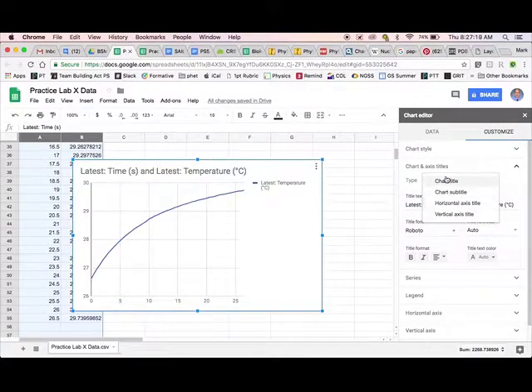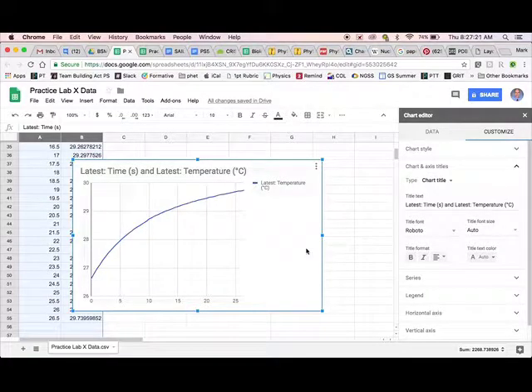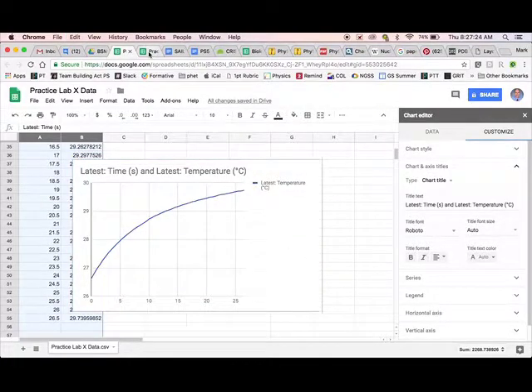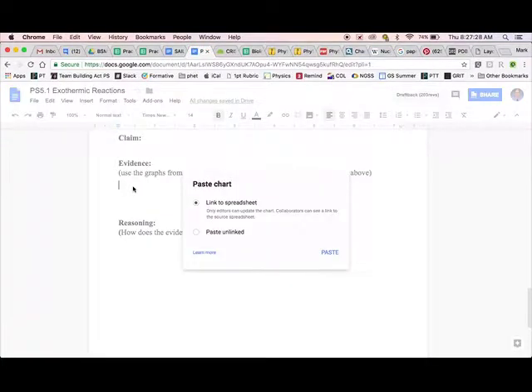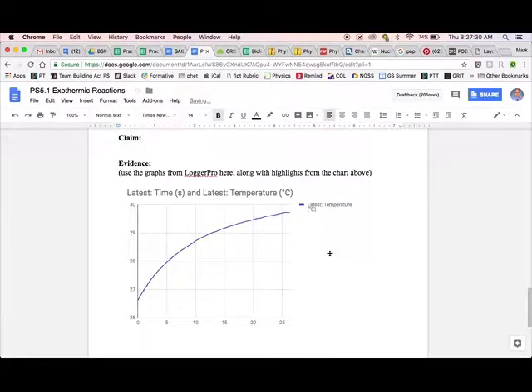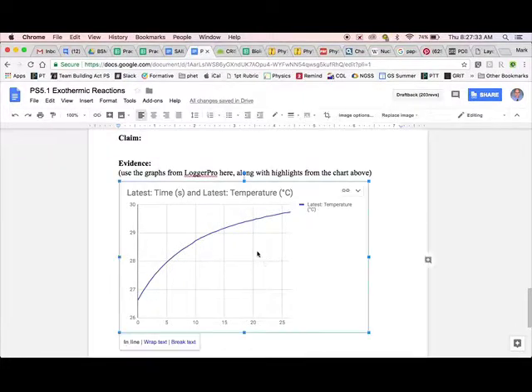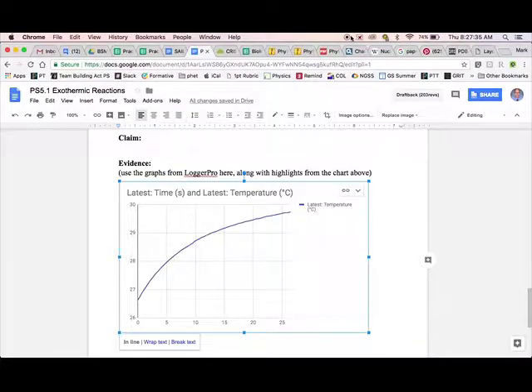Make sure it's labeled and named something appropriately that fits what you're doing. Then you copy that, head to the document, head to the Google document and you can paste it right in there. Paste. Probably not going to have it linked. It's okay. So now you can adjust its size. There you go. Done.